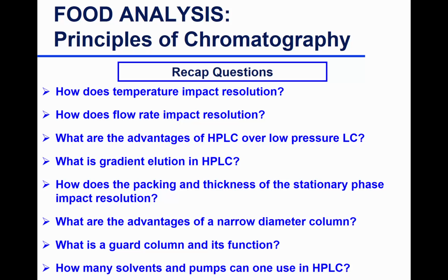What is the guard column and its function? What is its function? The guard column helps protect the column from like large particles going into it. That would block it up and give you ineffective resolution of peaks. Okay, so it's not necessarily large. You want to say something else, Ingrid? You want to go with what Erin says?